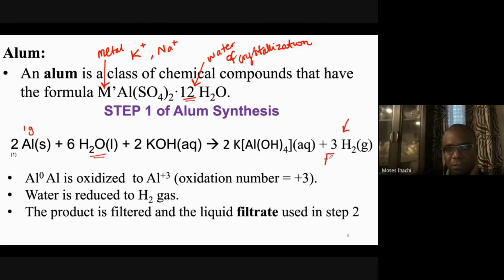That's why, for safety, we have to run this reaction in the fume hood, because if you inhale a concentrated portion of hydrogen gas, it's poisonous, toxic, and of course you'll be coughing and crying. So the reaction would have been done in the fume hood in the lab. Step number 1 demonstrates an oxidation reaction and a reduction reaction, so it is said to be a redox reaction. There's reduction and there's oxidation. So who is reduced, who is oxidized?